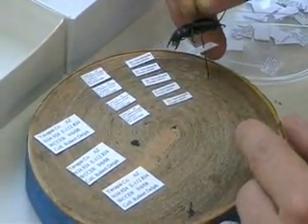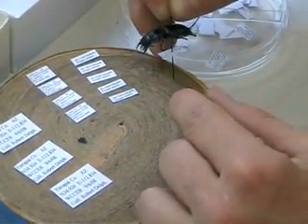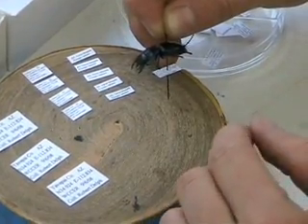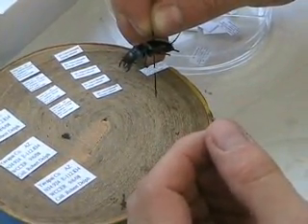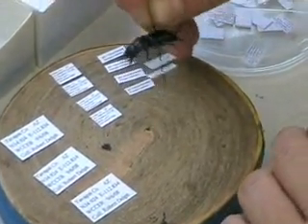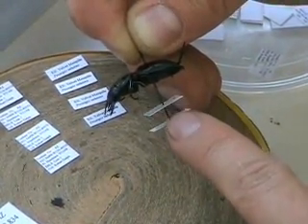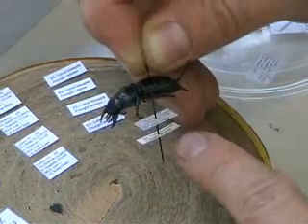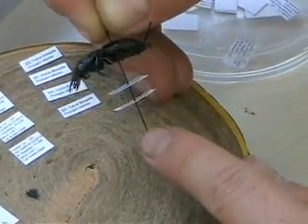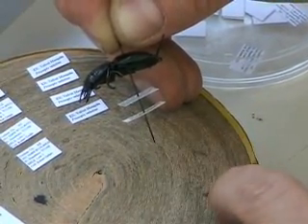Usually there's a second label — for example, one that says how the specimen was collected, whether from a pitfall trap, a malaise trap, or off of a specific plant. You put that label underneath the first. Leave at least five to ten millimeters of space so you can read the information on both labels. There's also room for a possible third label if needed.